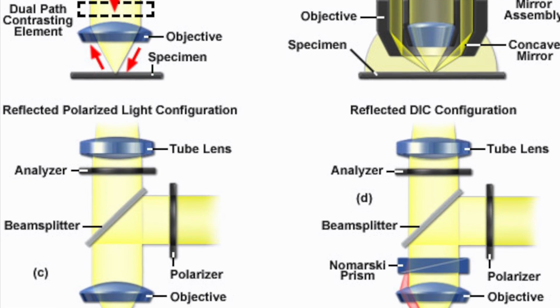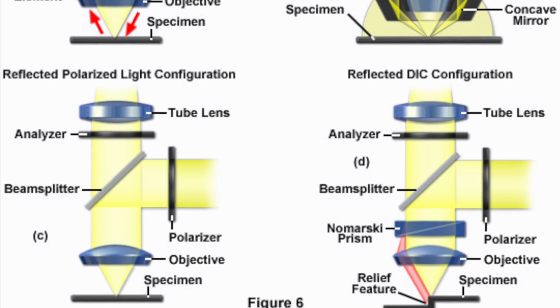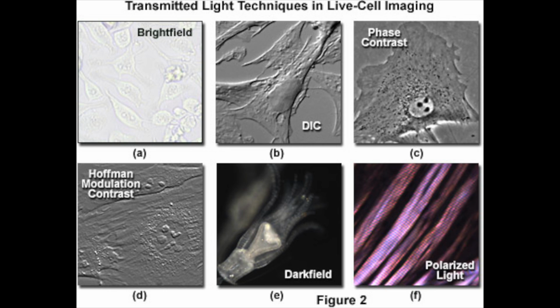Two main optical microscopes are the reflected light microscope, which reflects light off of the sample, and the transmitted light microscope, which passes light through a thin microstructure. Reflected light is used for opaque materials such as metal, while transmitted light is used to study translucent materials. Between the two, transmitted light microscopy achieves maximum illumination and therefore a more accurate study of the microstructure is obtained.